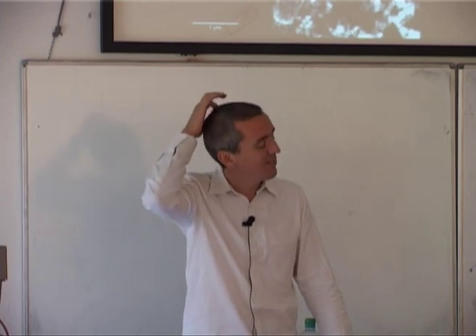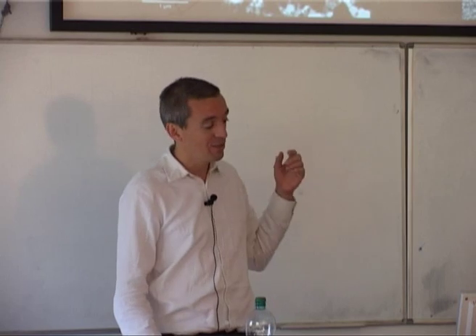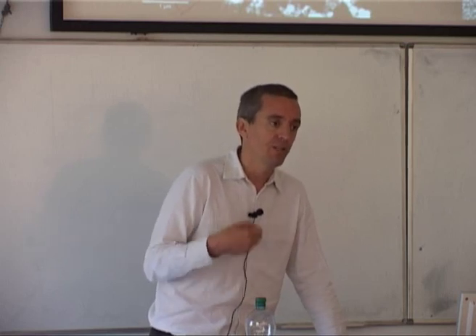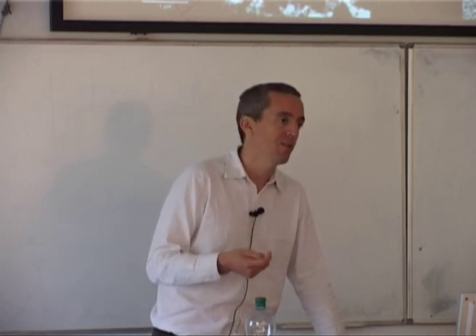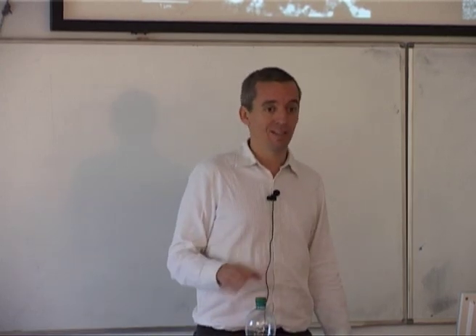That's what I will talk about today: how we can study interactions between life and minerals down to the nanoscale using electron microscopy, and more particularly transmission electron microscopy, and combine this with X-ray microscopy. And for the production of X-rays, we use synchrotron radiation. Please feel free to stop me at any time if there's anything that is not clear enough that I forgot to mention.